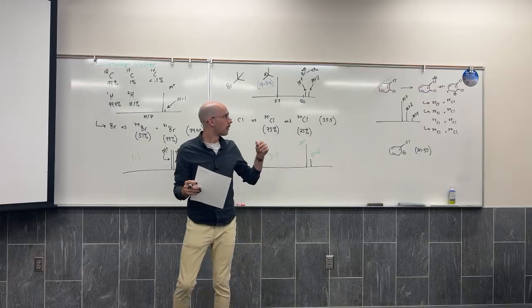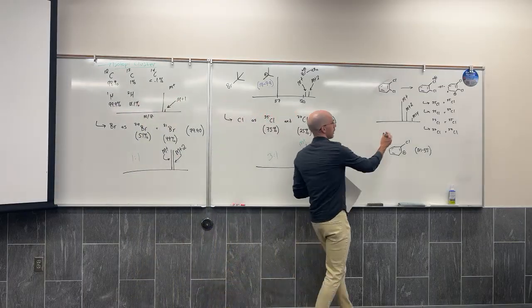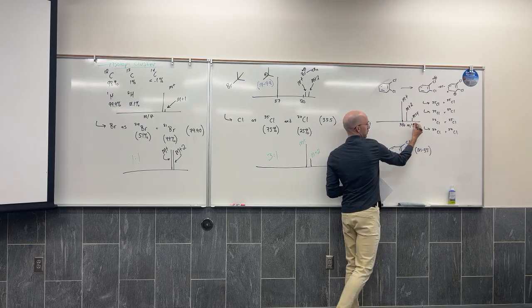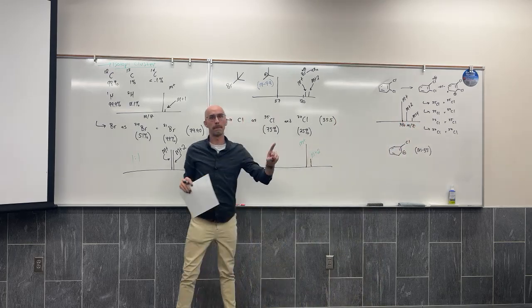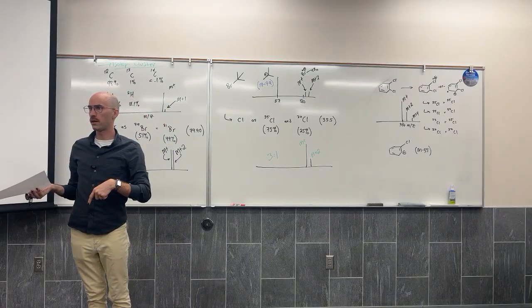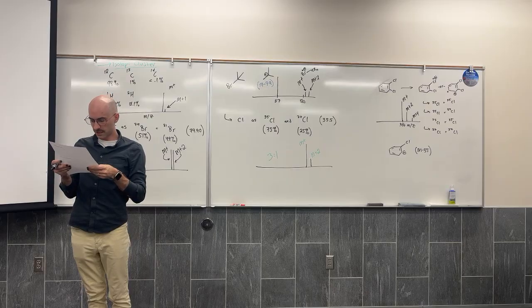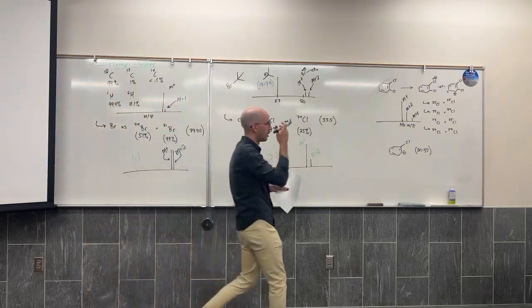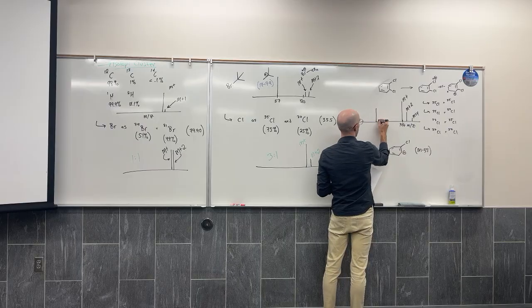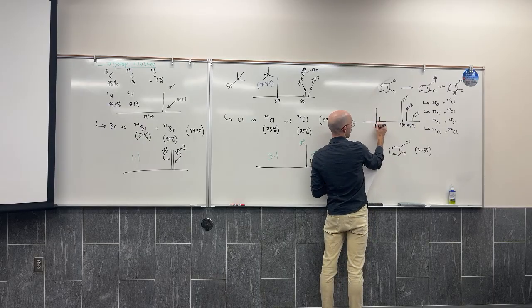If our molecular ion, I did all that math and then I lost it. If our molecular ion was 146 minus 35, 111. And do we see a signal at 111? Not just a signal, is it? It's a 3-to-1 isotopic cluster.